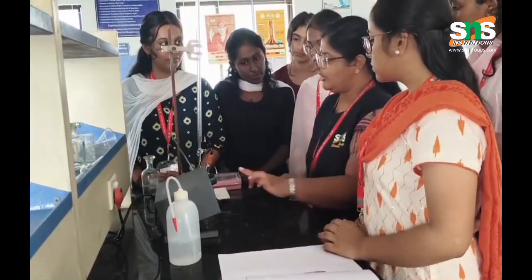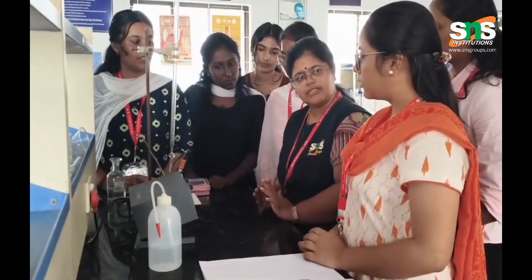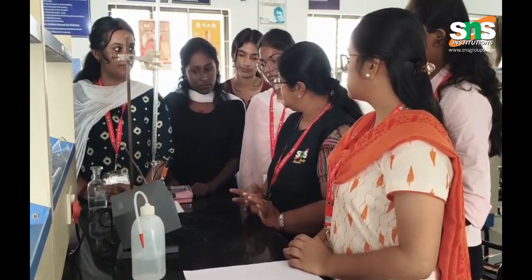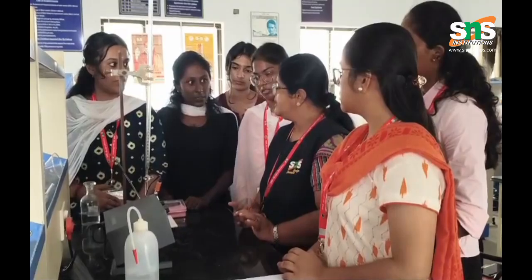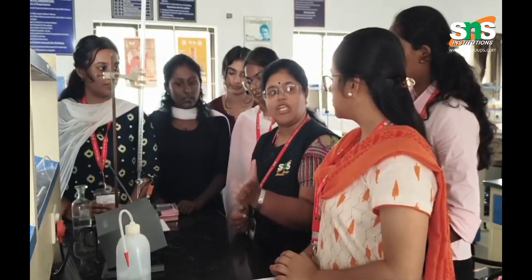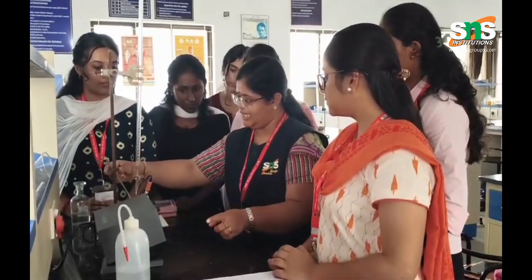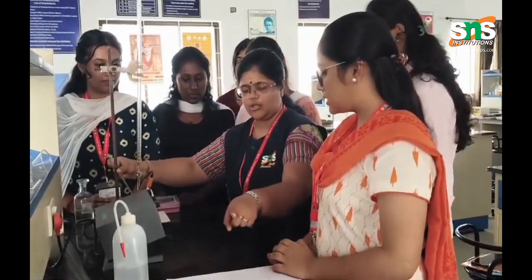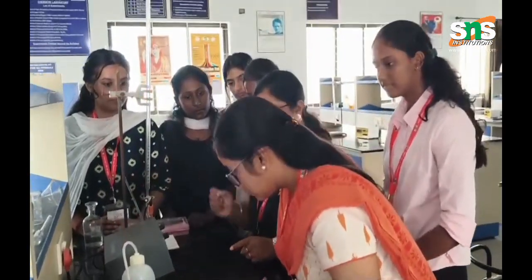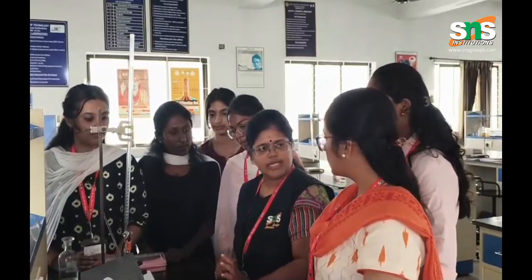Now what do you think the conductance value will do? It decreases. Why does it decrease? Because of the movement of H plus ions; it decreases because the H plus ions are getting neutralized. You can see the value getting decreased. Note down the value: for the volume 0 ml you have a value, and after adding 1 ml the conductance value has decreased.